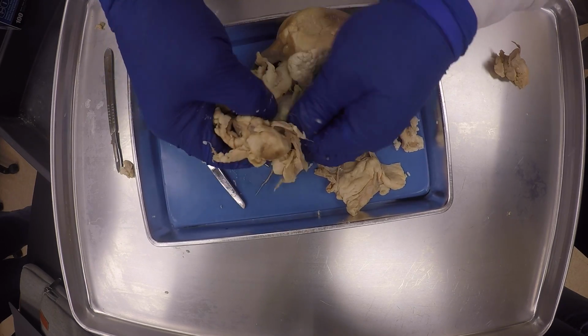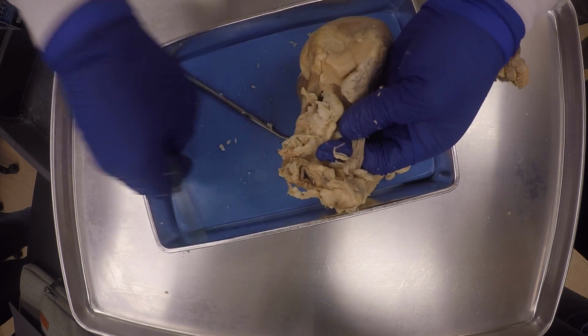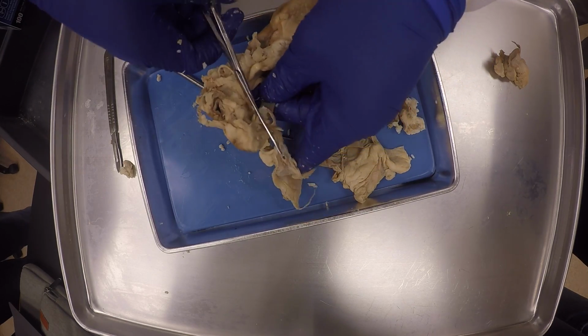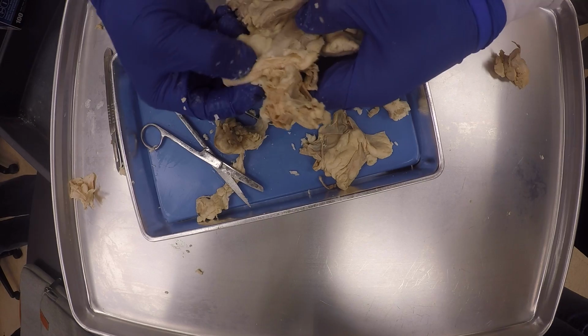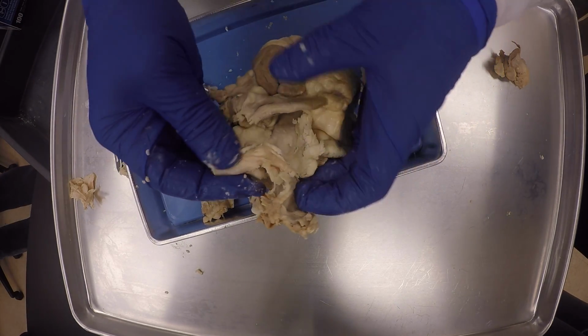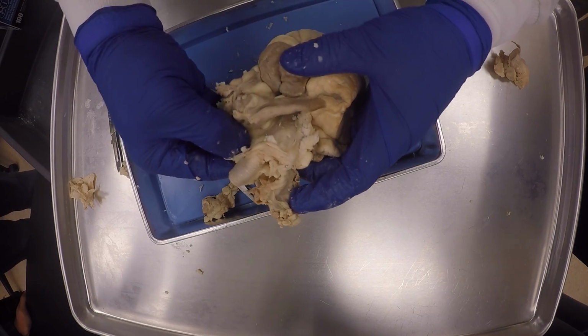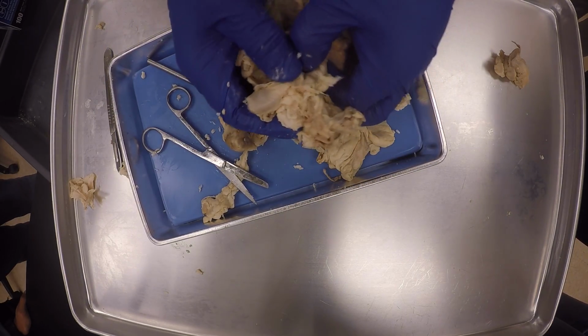Yes, lost a lot of fat. I'm sorry. And this is the aorta right here. Do you see how it's already starting to curve? The aortic arch is going to start to curve. Okay.